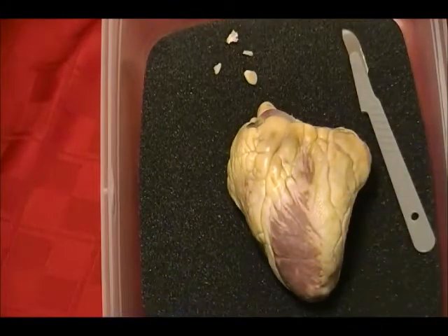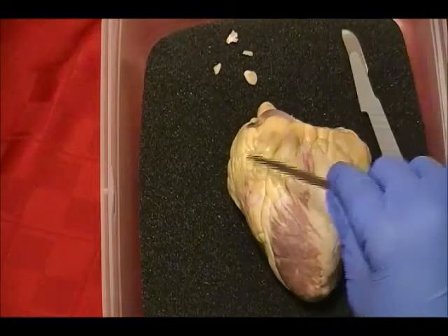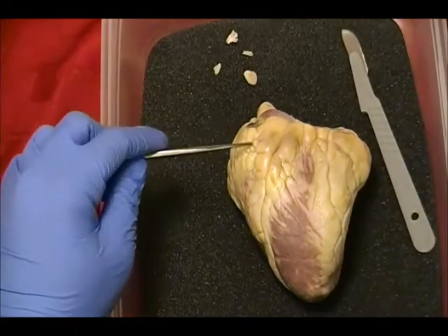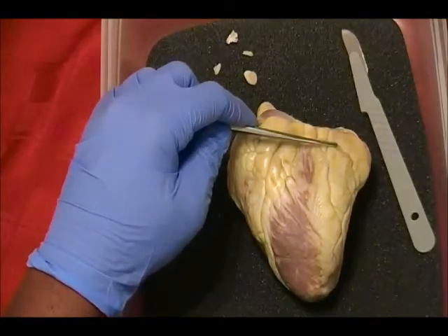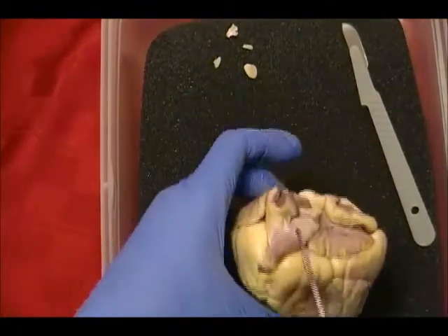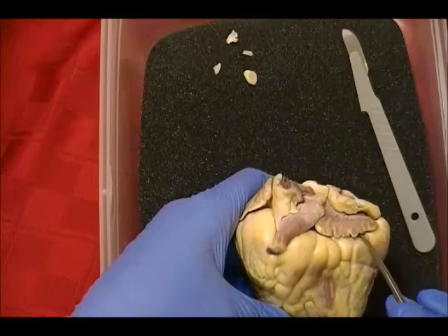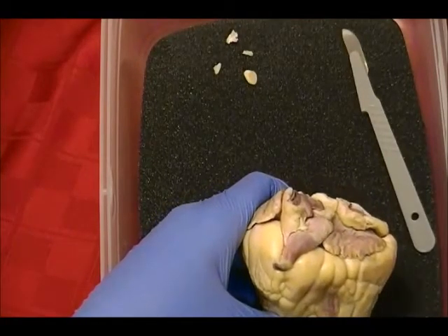The right and left atria, the right atrium is this area here. The left atrium is this area here. The blood in the right atrium is deoxygenated, and the blood in the left atrium is oxygenated. The right and left auricles, we have here, this flap here is the right auricle. This flap here is the left auricle. The auricles are used to slightly increase the atrial volume of the blood going into the atria.